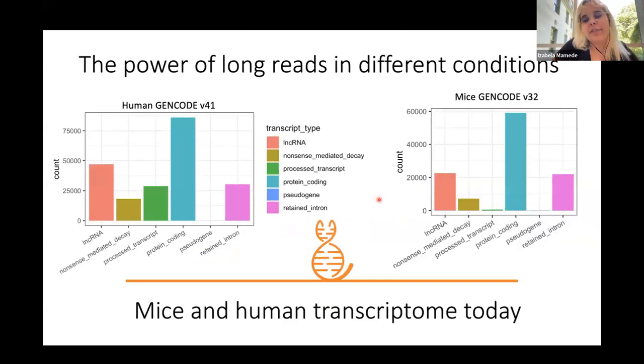So what we have today is that a lot of people are doing long reads of many genomes, and we have a very big variety of isoforms for each type. There are also long non-coding RNAs that we are not going to touch. They are completely different from this. What we're going to touch today are all the isoforms that can be called unproductive, the non-coding isoforms processed from coding genes. RNA polymerase II transcribes a coding gene, but it becomes an unproductive isoform because of problems with start and end sites or problems with splicing.